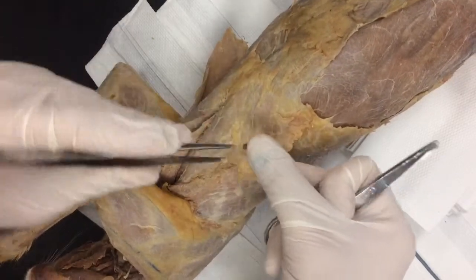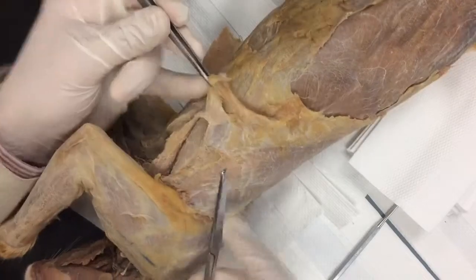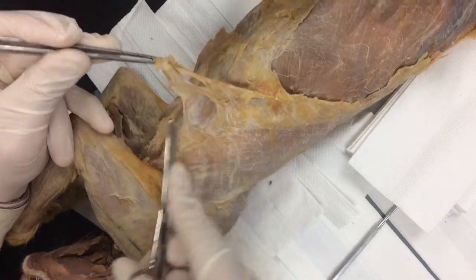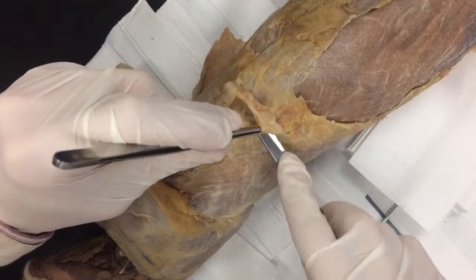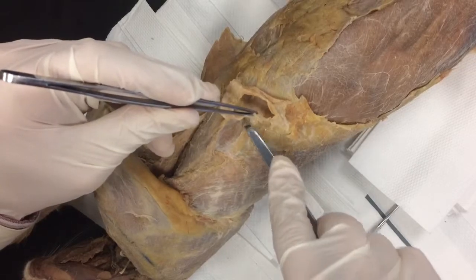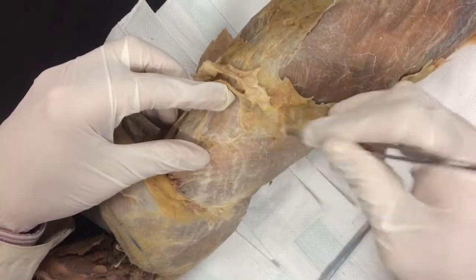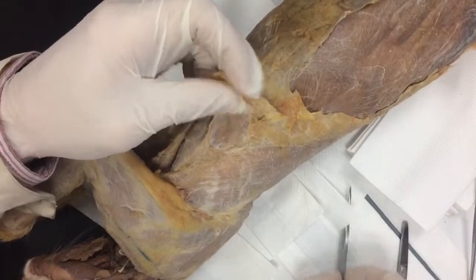This is the toughest part — trying to find your way through here without tearing up xiphihumeralis. Looking underneath here, I can now see the edge of pectoralis minor. See the fibers are running the other direction? Right there is daylight — if you look underneath here, there's the edge of the muscle. This would be a lot easier if you had more experience. Here's xiphihumeralis right here. These fibers are the wrong color; those are the wrong ones. There we go — that's the color I'm looking for right there.